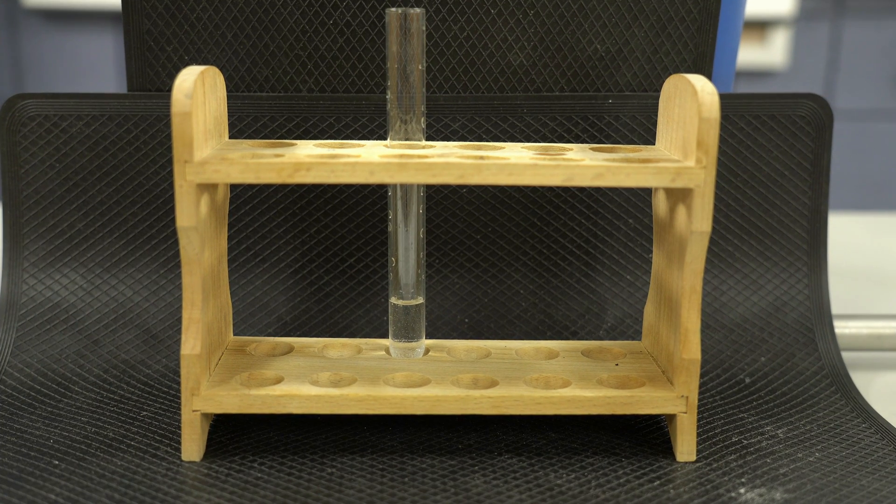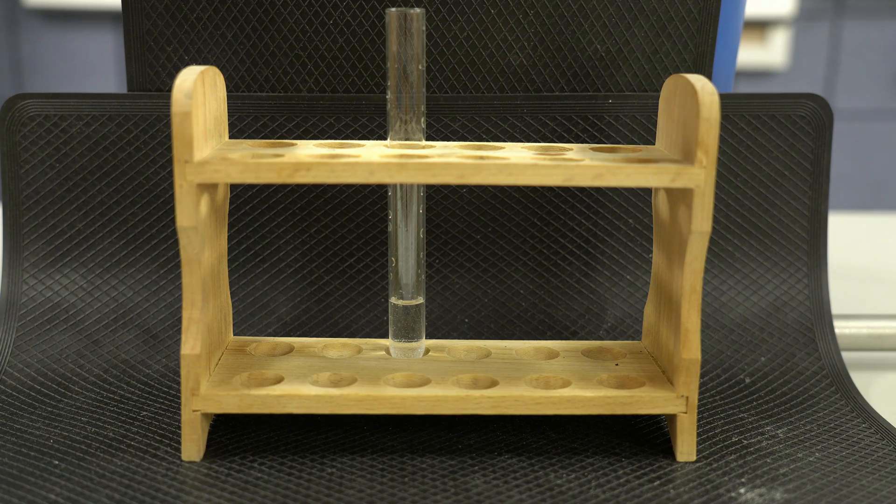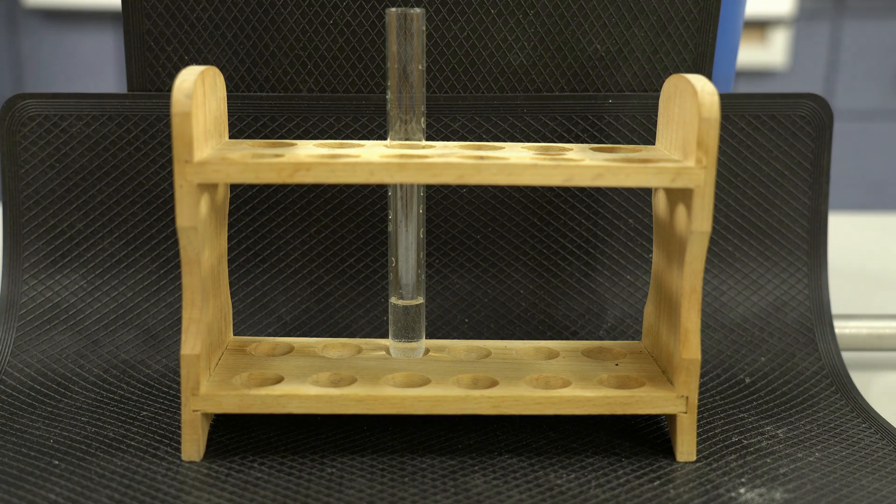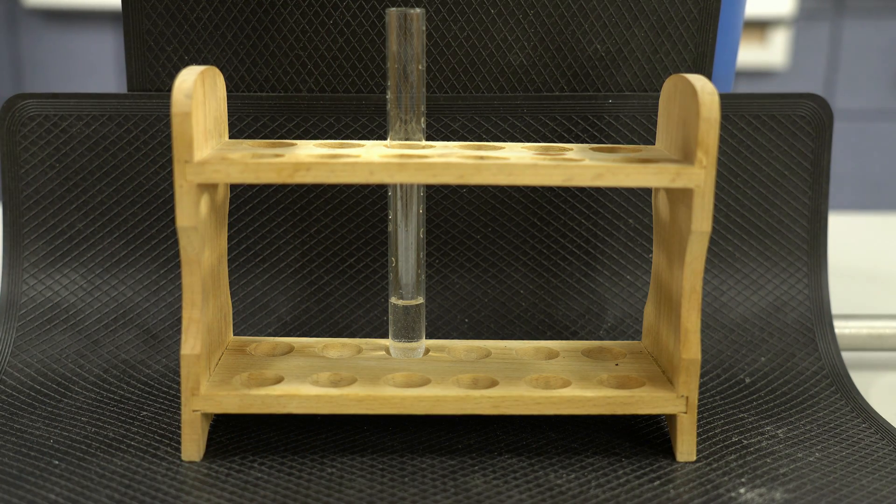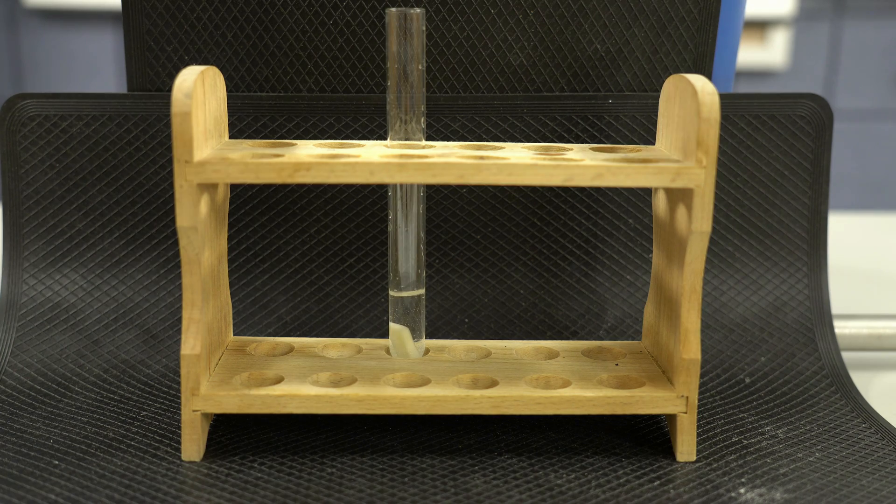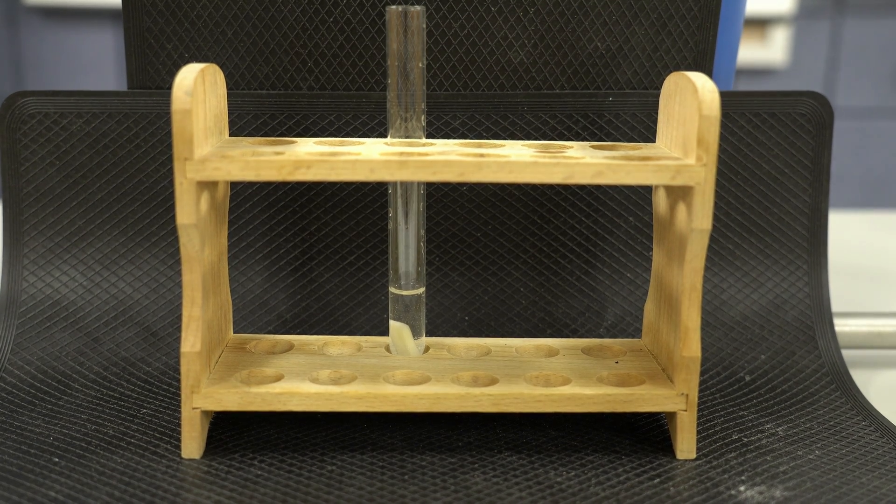Here we're going to observe a normal catalase reaction. I've cut a piece of potato and we're going to add that to the test tube. I've got 4 mL of hydrogen peroxide located right there. I'm going to drop that in and let's observe what happens.